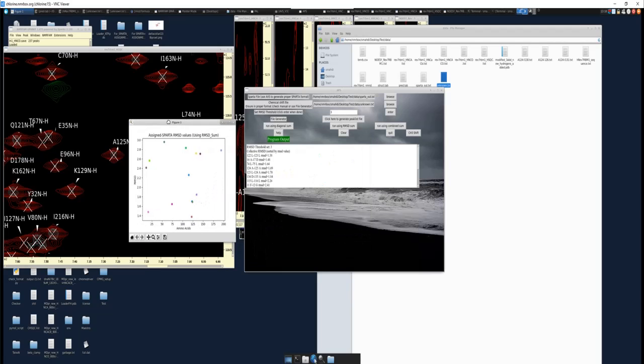So let's first look at the text output. You have a number of matches, right? Again, these are pairs of two that are matched with your Sparta Plus file. This is sorted from lowest RMSD to highest. Generally, the lower the RMSD, the closer your experimental values will be to what's predicted. You'll see here, leucine 122 and leucine 123 are one of your matches.